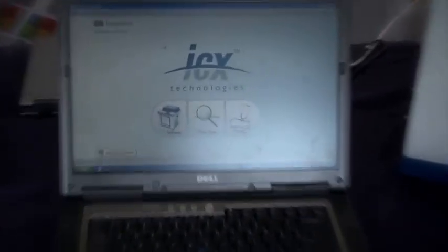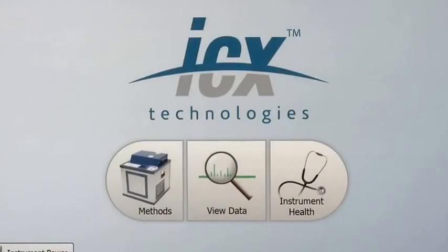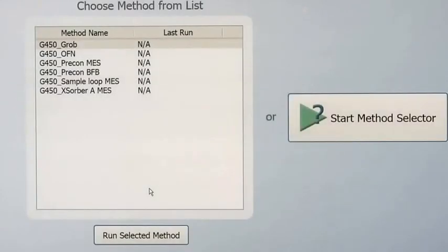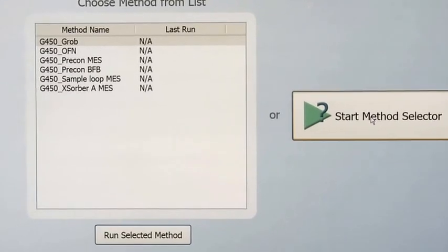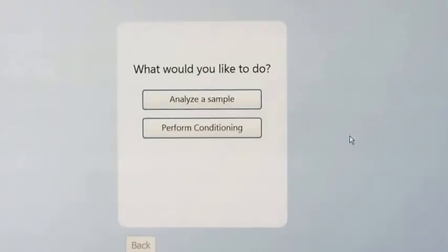Once you've docked your Xorber, you can select your method using the Griffin system software. Today we're using level one software, which is a simplified user interface. I'm not quite sure what method to use, so I'm going to use the method selector. If you did know what method you wanted and remembered from your training, you could just select from the list.